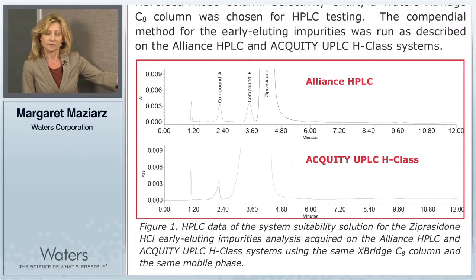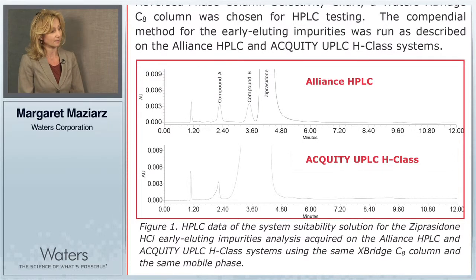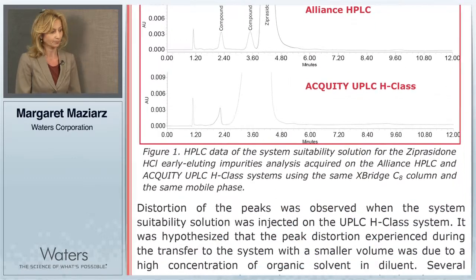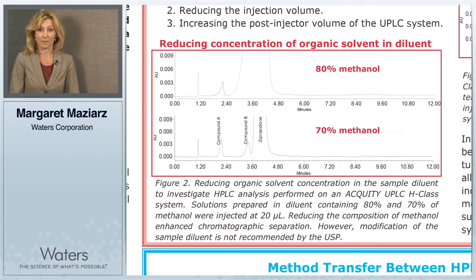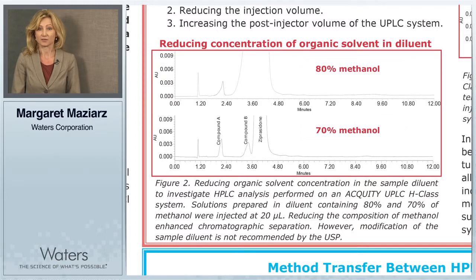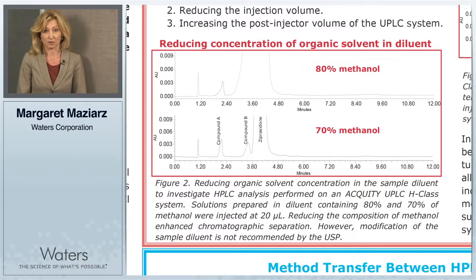The testing included reducing the concentration of organic solvent in the sample diluent, reducing the injection volume on the system, and increasing the post-injector volume of the Acquity UPLC H-Class system. As shown in figure two, we reduced the composition of methanol in the sample diluent from 80 to 70%. We found that decreasing the concentration of methanol in the sample diluent drastically improved the separation and resolution between the peaks. However, modification to the sample diluent is not recommended by the USP.